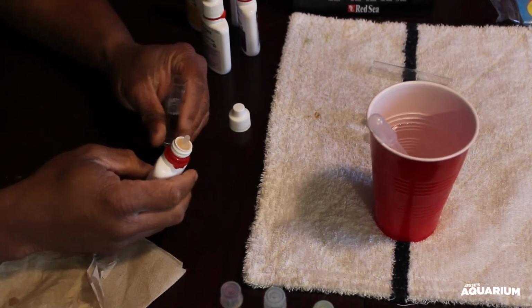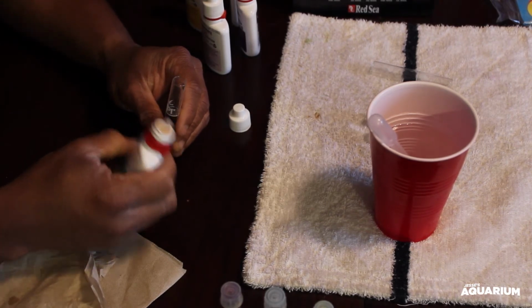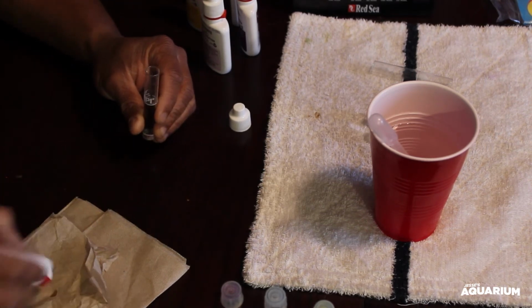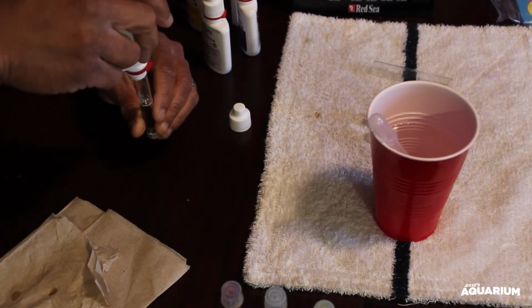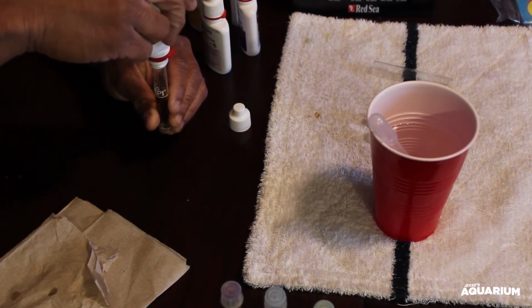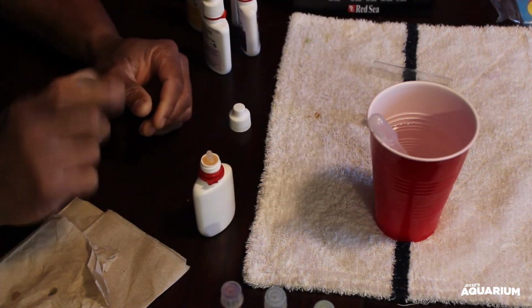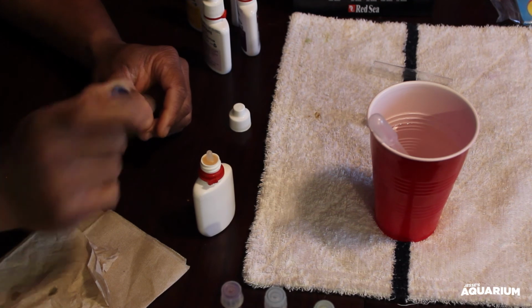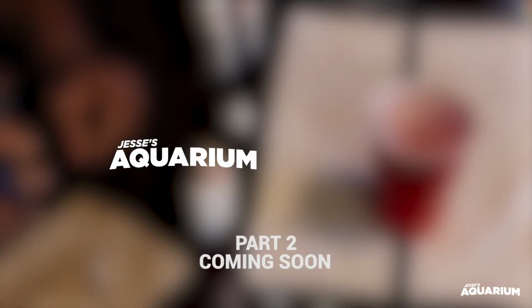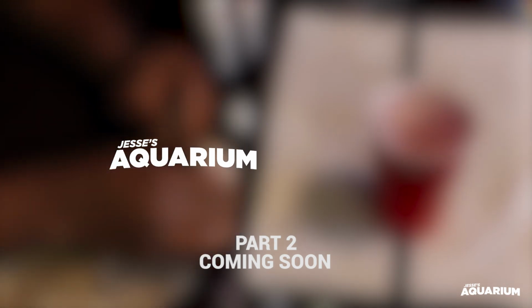I'm going to add more than 4 drops, really more than 5 drops right now, because I know mine is well above that level. So here we go. Alright, stop. Give it a shake. As you can see, it's bright blue. Now what we're going to do is keep adding a little more of this solution.